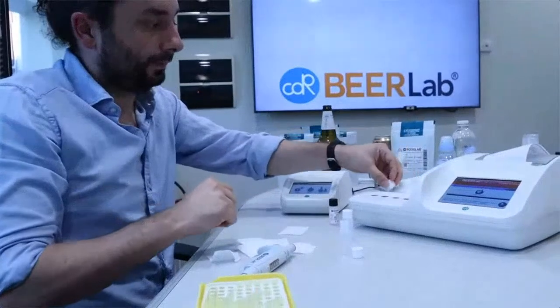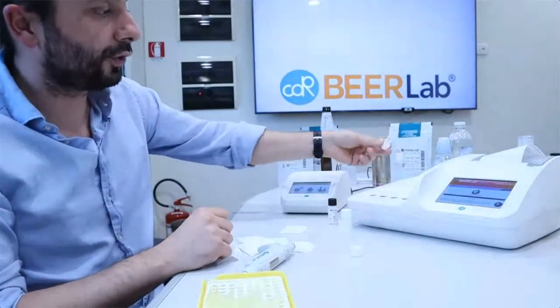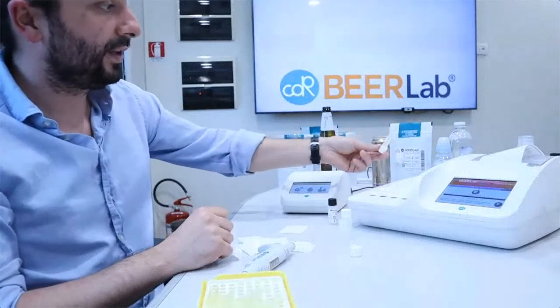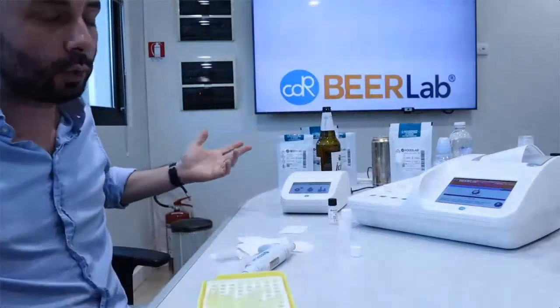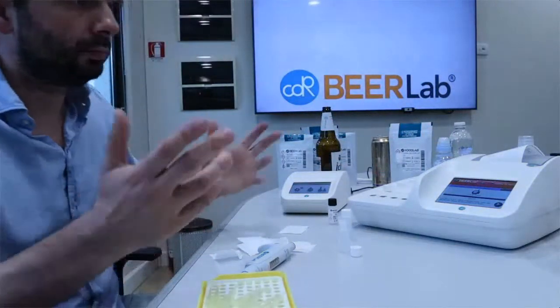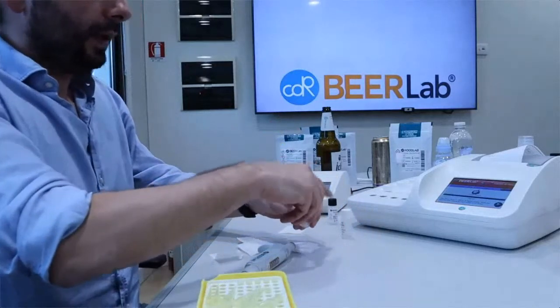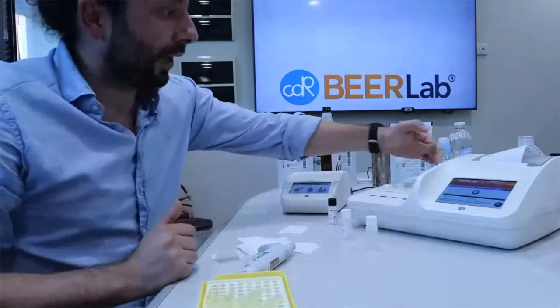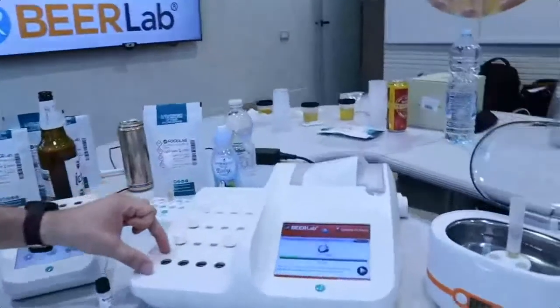So now we shake by inversion, and we start the timer. Now we have just to wait 1 minute, so you can do your stuff in your brewery. So as you can see here, we have the incubation part. Okay, this is the reading part.